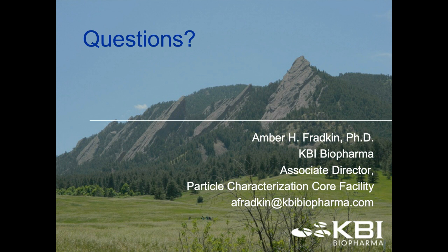Well, I've seen in some of my past lives, I've done a lot of particle characterization for large pharma as well, working with Amgen and Merck previously. We've certainly had questions that we had to address where regulatory agencies were asking for classification of particles at a minimum. Are these silicon oil or are these protein, when you just provide concentration data? So I've seen push for identification in the subvisible size range.